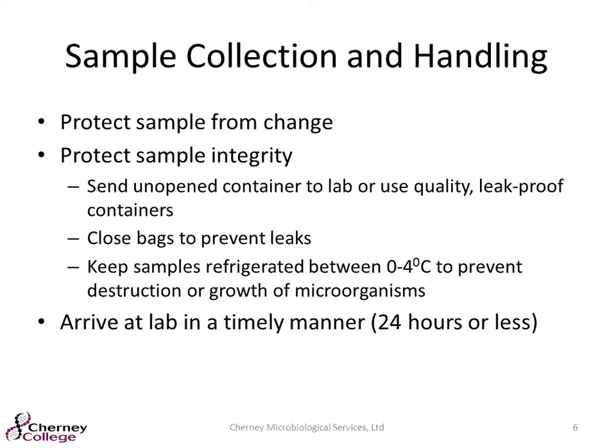And something to keep in mind too, if you're out in the plant collecting, say, environmentals, how long are you out there? How long is that first sample out there by the time you get it into the refrigerator? If you're out sampling for hours, that first sample you've taken has also been sitting out there for a couple of hours. So make sure you get those batched and refrigerated as quickly as possible, and then try to get them to the lab in a timely manner. Obviously if it's a plant lab, that's much easier. But if you're shipping them to us, get them here as quickly as possible so that the integrity of the sample isn't changed.